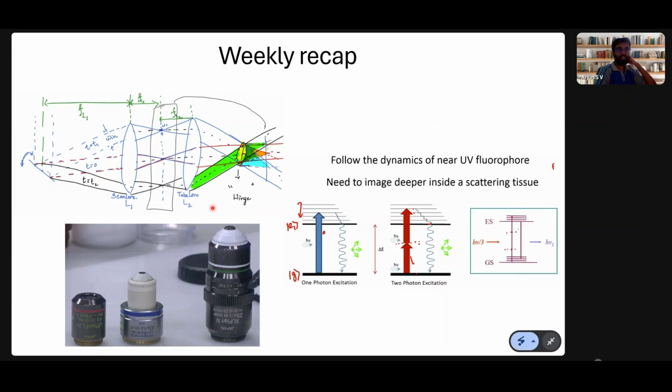We started off from where we left off last week, where in week 9 we saw the concepts of optical hinge points as well as spatial and temporal focus. This week we continued with the same concept: before starting any microscopic experiment, we need to make sure that the beam width is aligned to the specimen of our choice in order to image the biological specimen completely.